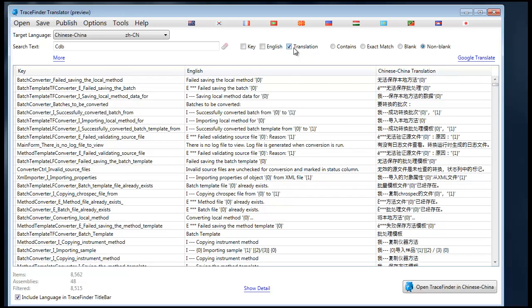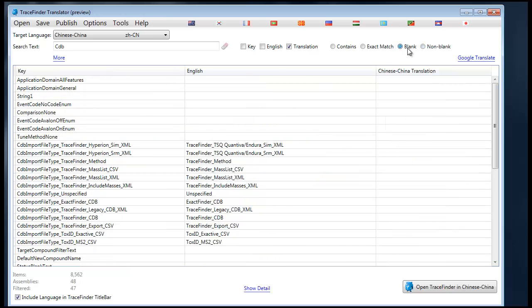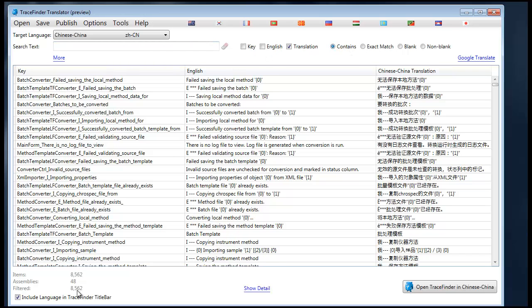Or if I wanted to search only for translations that are non-blank. You'll see down on the bottom left, you have the filtered indicator, which shows you how many results are displayed after the filter has taken effect. So of the 8,562 resource strings that have been found, after applying the filter, 8,515 are visible in the grid. That will update as the filter is applied. You can press this eraser button to clear the search, and once you've cleared your search, your filtered items should match.